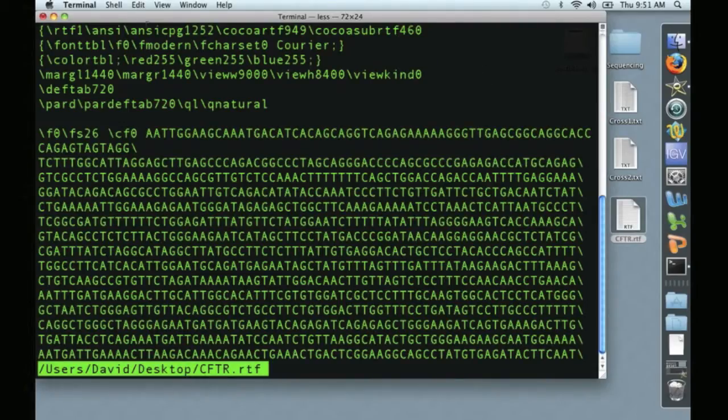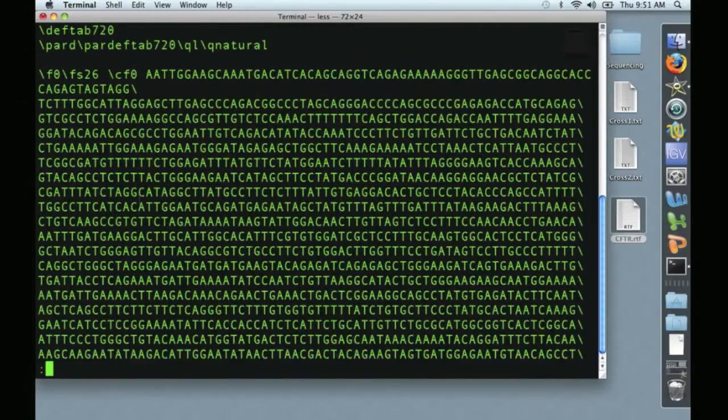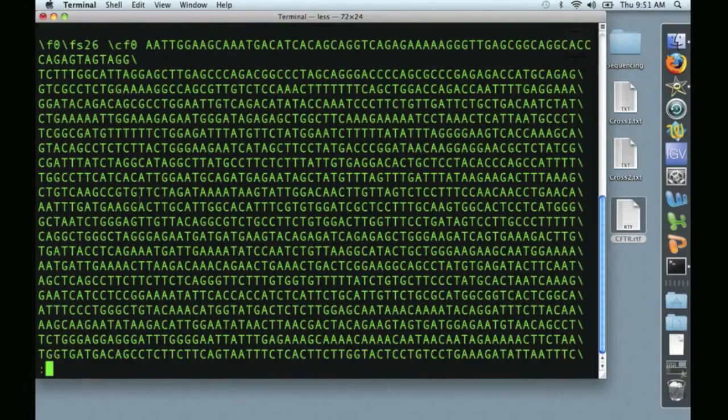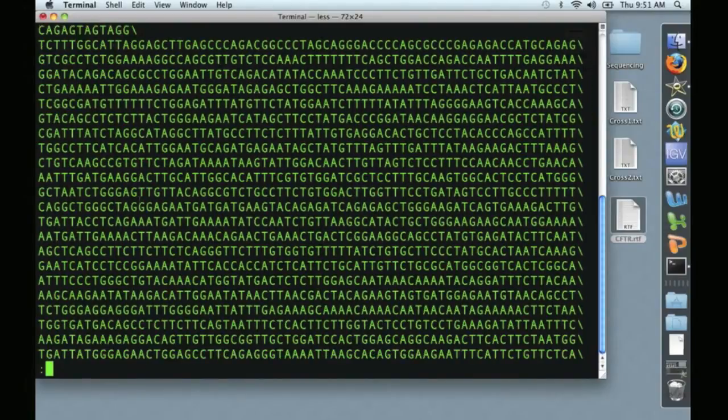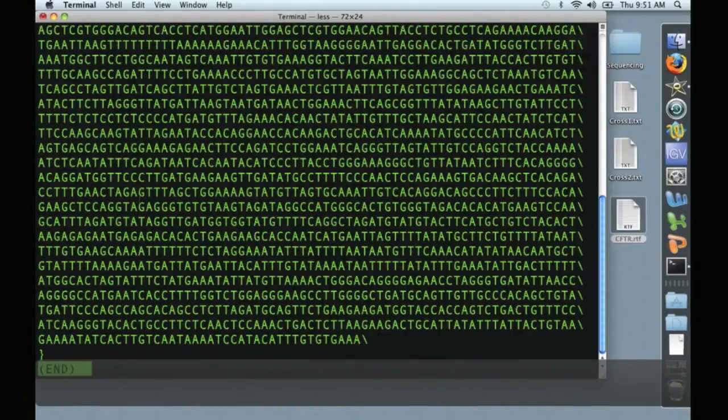Up at the top is the identification information from GenBank, and down here is the sequence. I can press RETURN to scroll through line by line, or I can press SPACE to scroll through a page at a time.